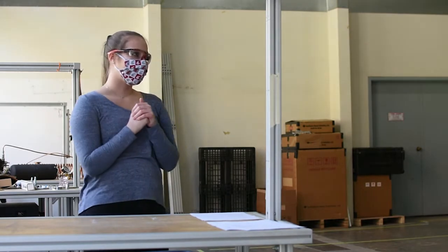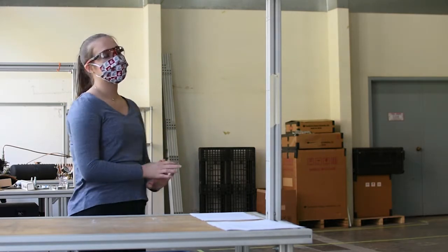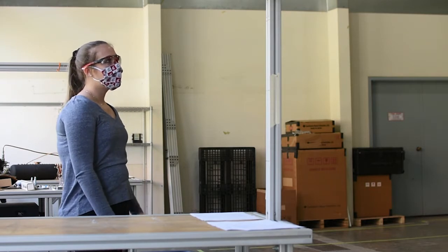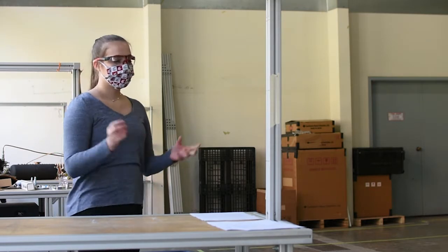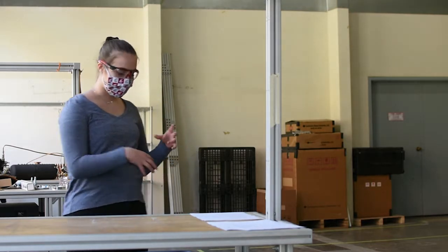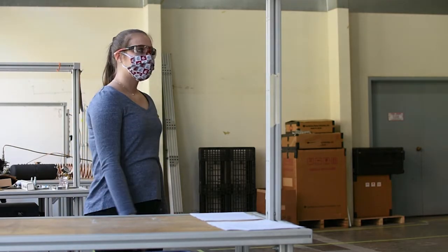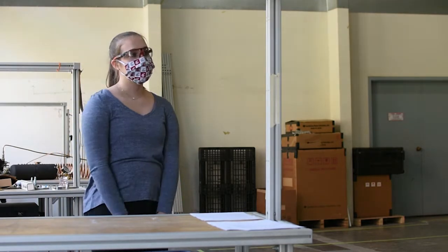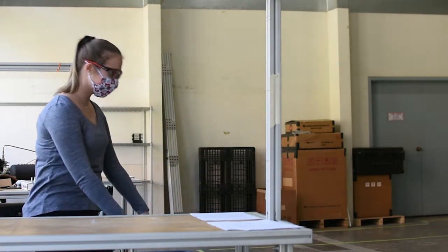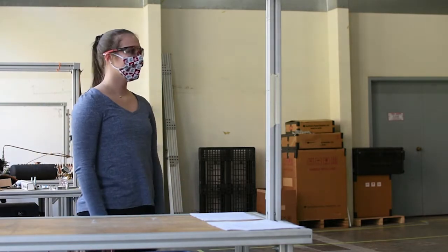So everyone here, I think, has heard of PPE. Personal protective equipment is definitely the first thing you want to think about when it comes to handling LN2. The big takeaway is you want non-wicking clothing, so you don't want the LN2 to be caught anywhere and held against your skin, because that's what leads to a cold burn. For example, we want pants untucked from shoes, so skinny jeans are not a good example. Shirt untucked from your pants, that kind of thing.